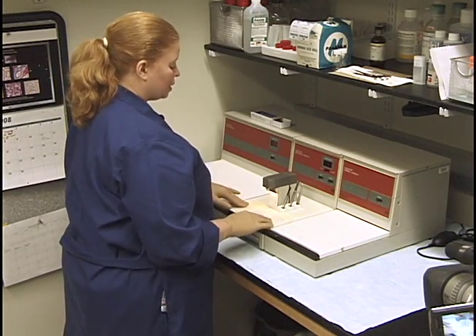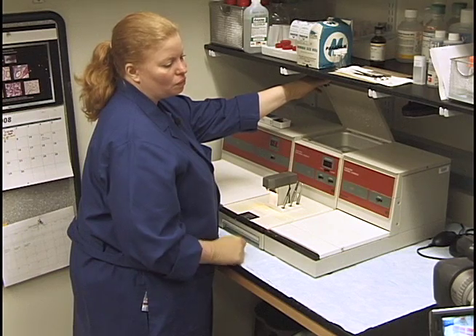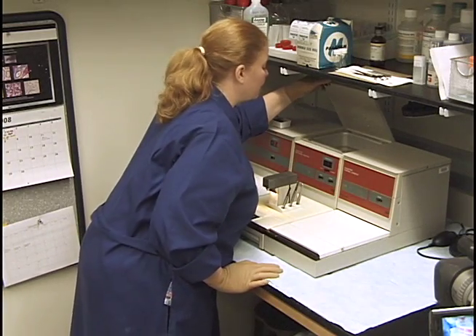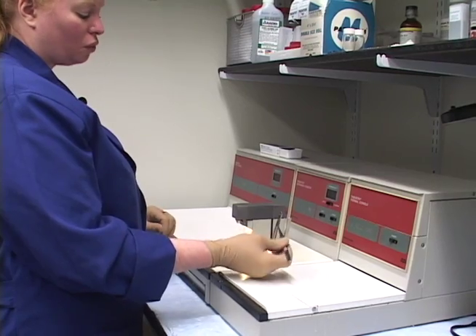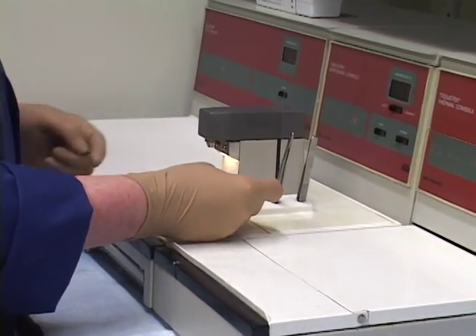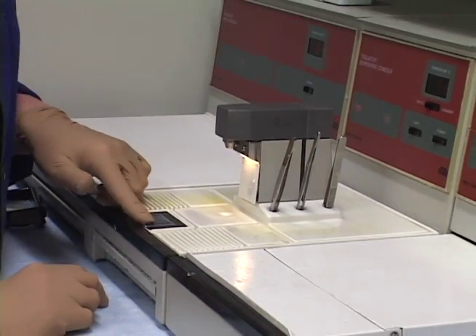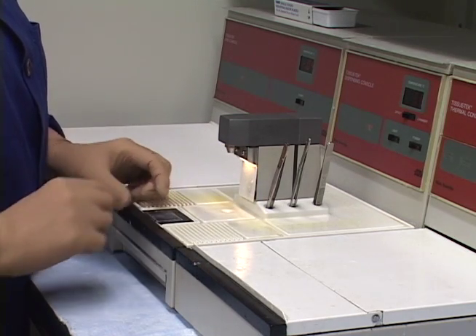Here we have the dispensing console where this chamber holds the paraffin. I never fill it more than three-quarters full — usually I keep it at half full. This right here is a warm stage and these are warmers for the forceps. This lever is for dispensing the paraffin. This little area is a cold spot for a quick chill as you're aligning your tissue.